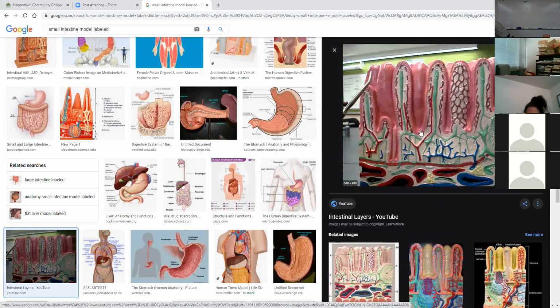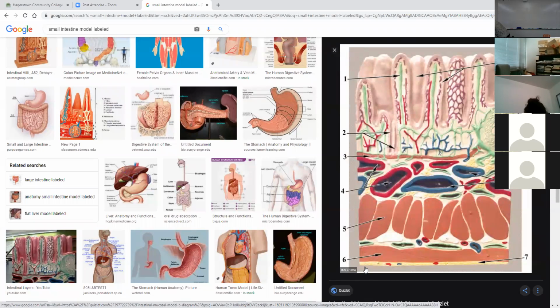This is a cross section of the intestine. And the way I can know this is it has these villi here, these finger-like projections. In fact, this is our model right here. So there's villi, and these villi have these blood capillaries right here, right? And it also has a lymphatic capillary, the green thing, number one right here, called a lacteal. And this is the epithelium around here.